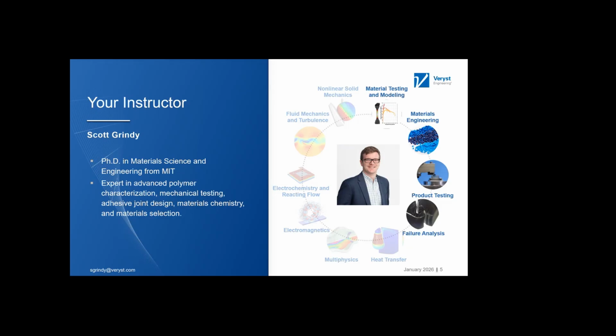I work with clients on analyzing their polymer materials, helping them understand why a material might be the correct one, why it might not be, how we can evaluate whether or not it's the correct one, why their device might be failing, and how their products' capabilities are informed by the intrinsic material properties of the materials that they're using.